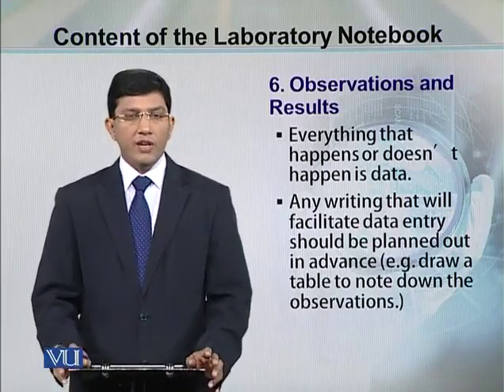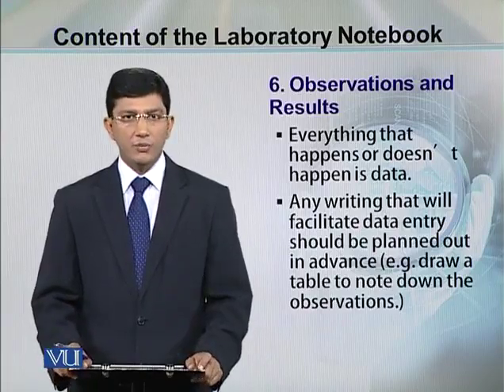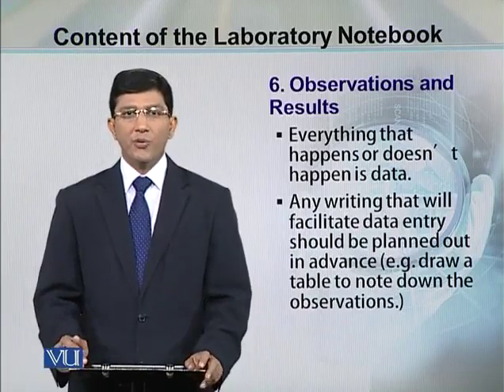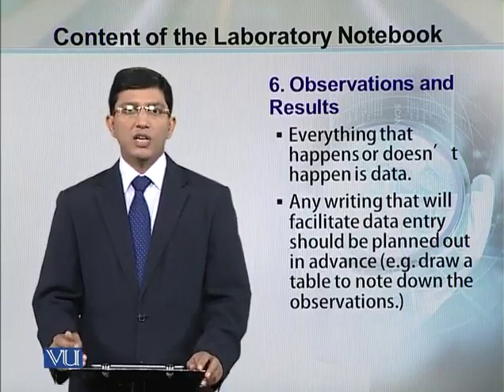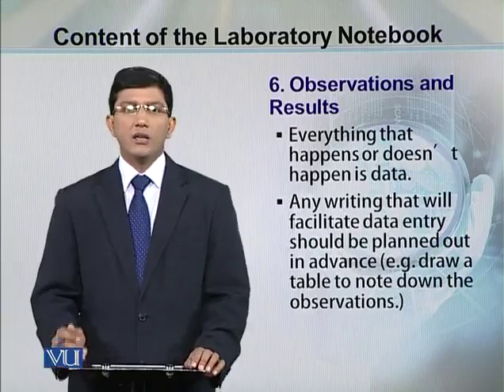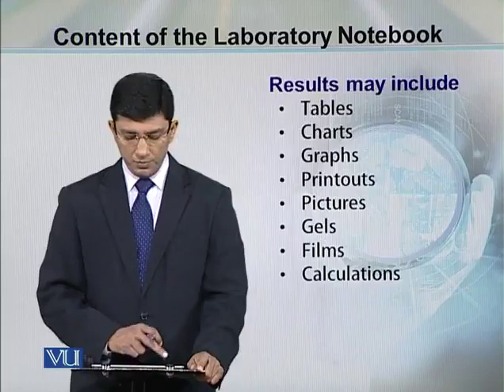If you already have an idea of what kind of data you have to enter at the end of the experiment, prepare beforehand. Draw the tables before you start the experiment so that you can simply enter your results in that particular table.